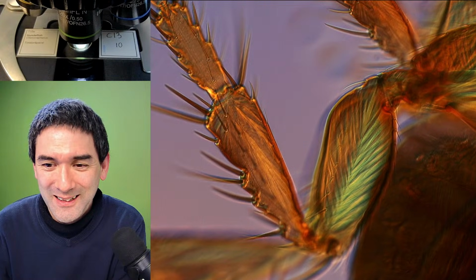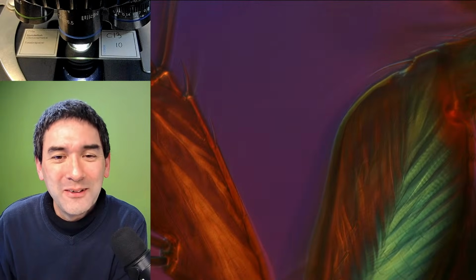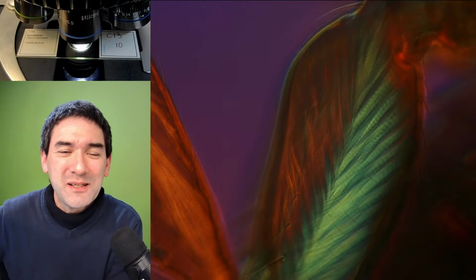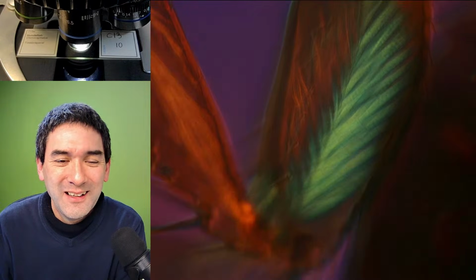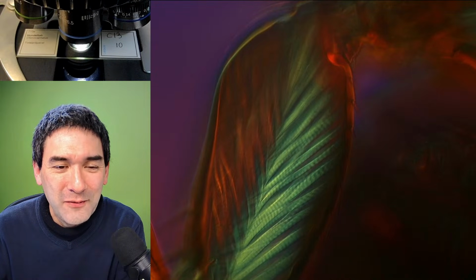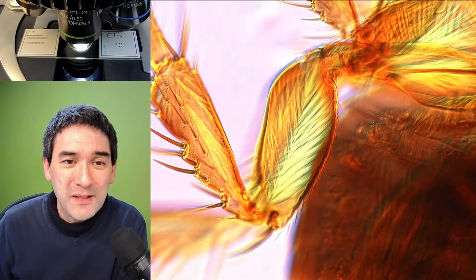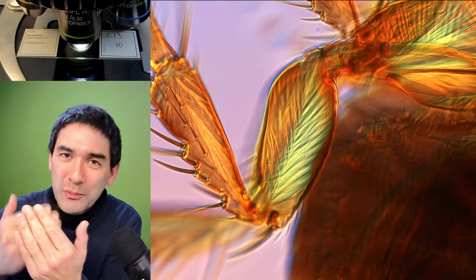So if we zoom in here, that's the other thing that I want to do. Look, this also looks quite nice. And what do we see again here inside the flea? Again, the muscles, right? And again, you can see those stripes that we talked about. There is the commonality of life, as I call it. Again, you have those light and dark bands inside the muscles here. So it's quite a nice one. This one was also one of those specimens that are a little bit too large, so I had to stitch them together to make a nice picture.